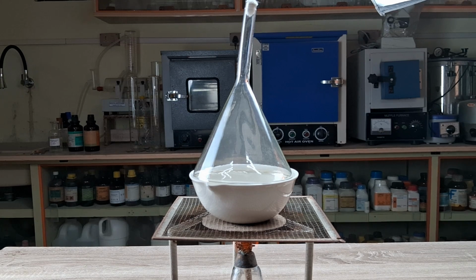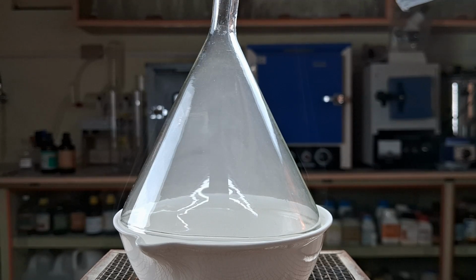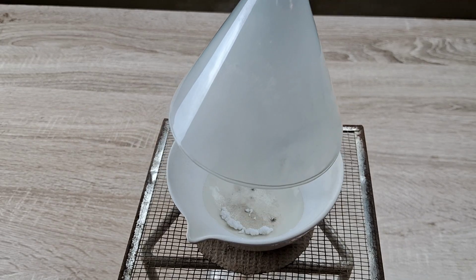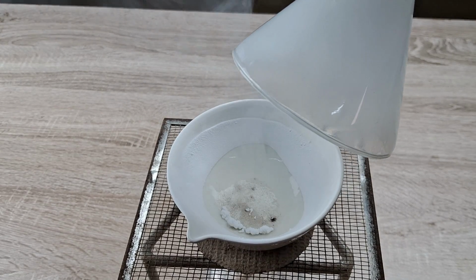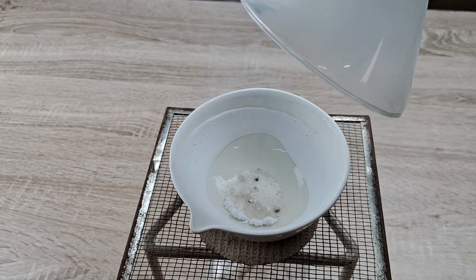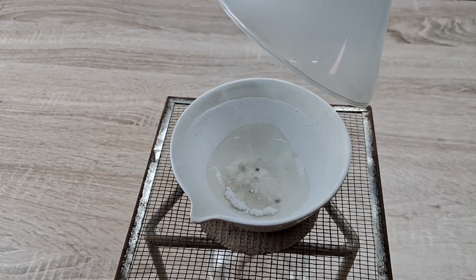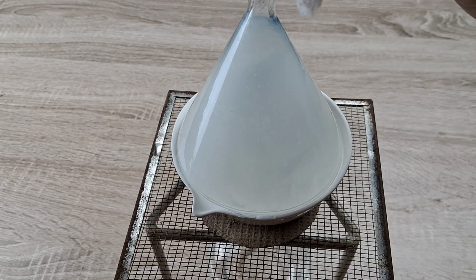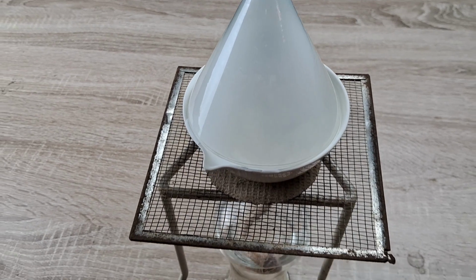Observations: after a couple of minutes of heating the ammonium chloride, you will observe copious amounts of white fumes begin to form and occupy the inside of the funnel. The ammonium chloride salt also begins to disappear slowly and turn directly into a gaseous phase without any intermediate liquid phase. Meanwhile, throughout the inner walls of the funnel, which is comparatively cooler than the porcelain dish which is being heated, thick white deposits can be seen forming.